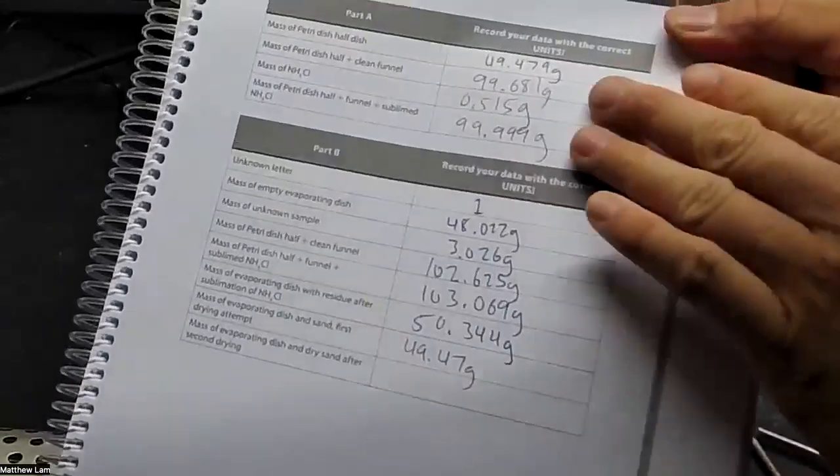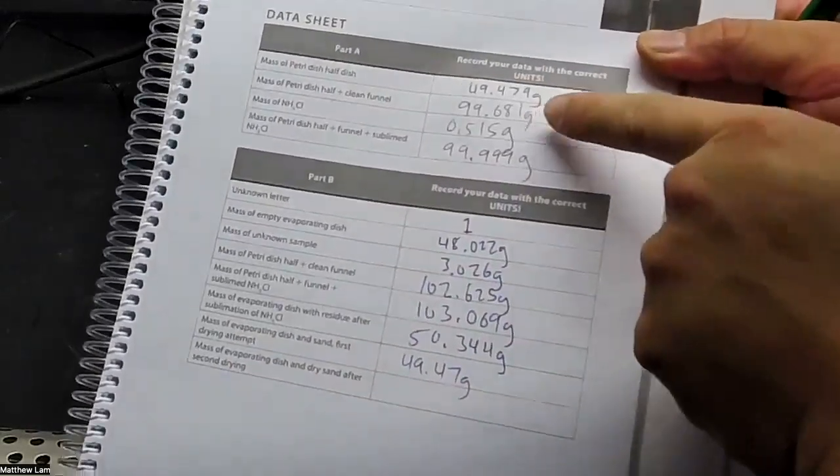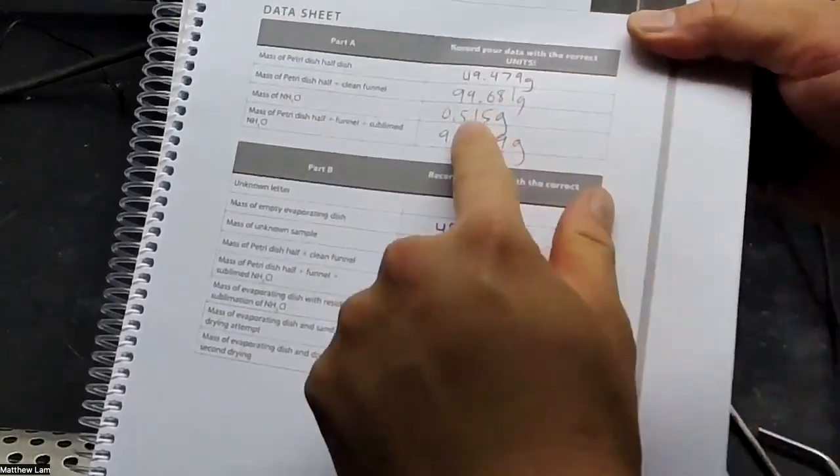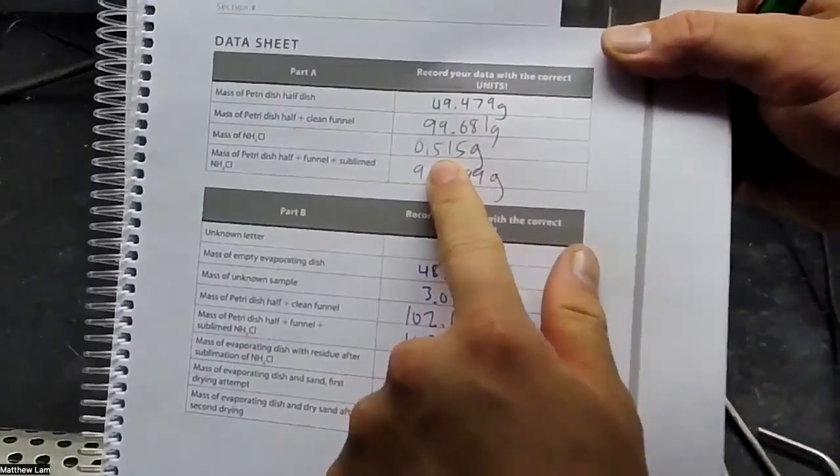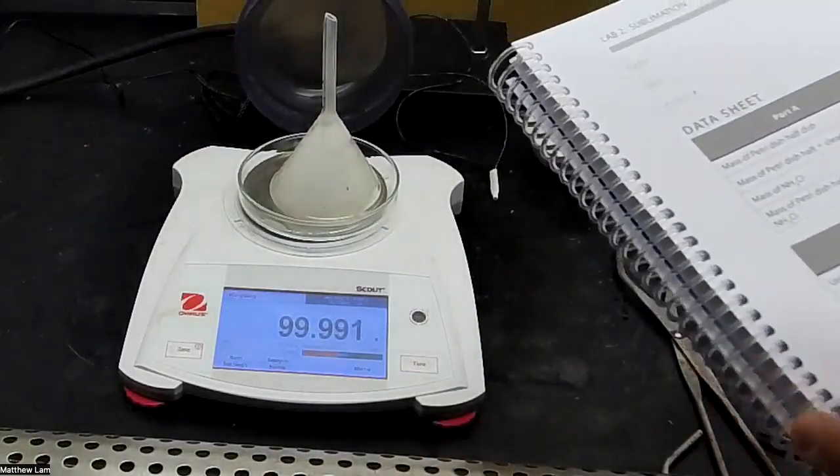So what we recovered was 99.999 minus 99.681 grams. And that's how much ammonium chloride we recovered. We can do a percent recovery by taking that difference and dividing by the initial mass that we used and multiplying by 100% to determine the percent recovered.